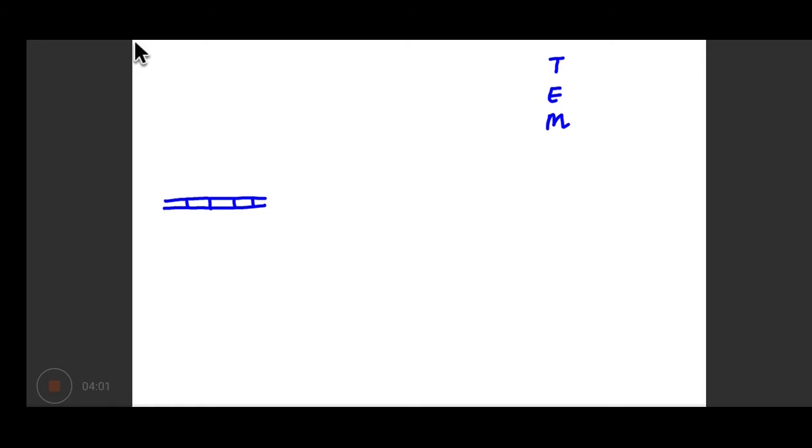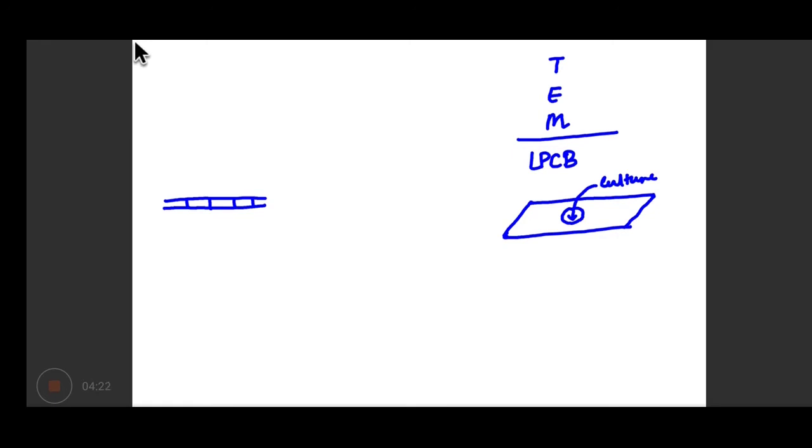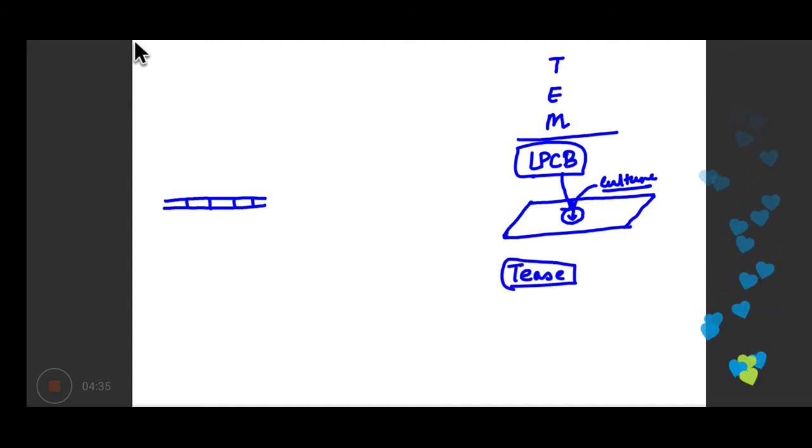So to make an LPCB mount, let us just briefly discuss this. So to make an LPCB mount, what we do is we take a glass slide and we take a drop of normal saline in which we add the culture isolate, and then we take a drop of the LPCB and we add the culture isolate, and then we tease the culture. What do you mean by teasing? Teasing means we take two teasing needles and they separate the structures.